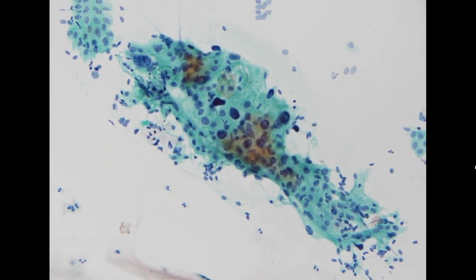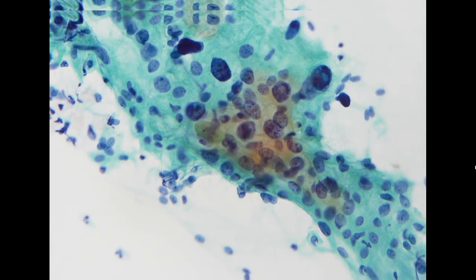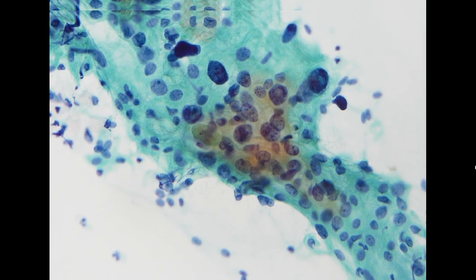Again, if we interpret the conventional smear, if it is a focal lesion, you would expect that it is in the same smearing direction. Okay? So here we start to see, yeah, definitely hyperchromasia, coarse chromatin, enlarged nucleus.